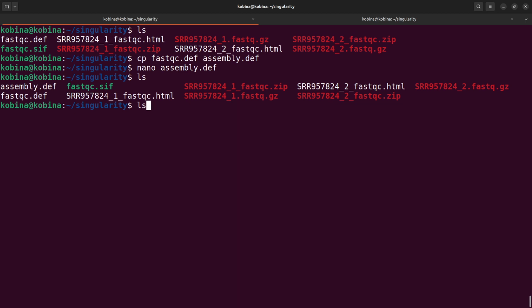If I go back to the previous command, which was successful, it was something like this. I'm using something similar, which is here. So that's what I have. Let's execute this command and install FastQC and SPAdes.